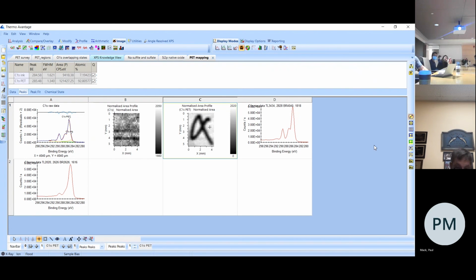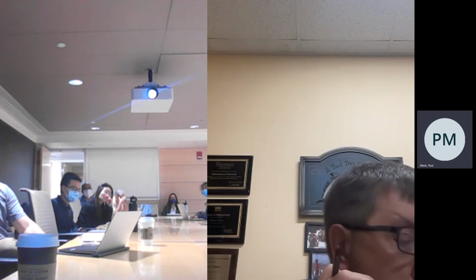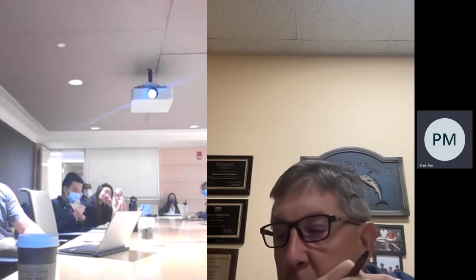Sure. First, she's asking how you make an image. What's your second question? The second question is, can you batch process data without an image by just pulling up multiple data? And then she's asking about batch processing data that's not necessarily an image or a depth profile. Okay, yeah, I've got you. Okay, so the first one. So on the first one, are you asking about how to actually acquire the data in the first place?